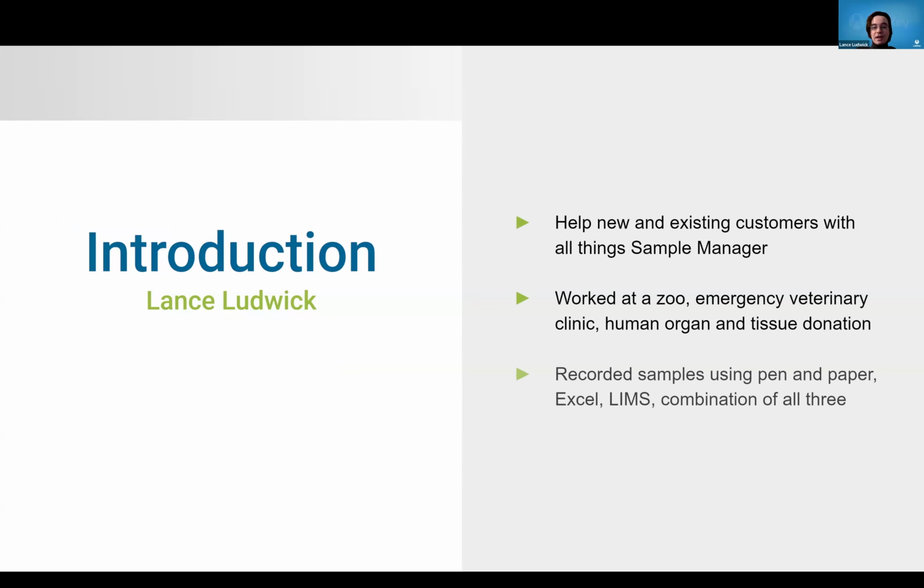At these places, I was recording my samples using a variety of different methods, from pen and paper to Excel, LIMS, or a combination of all three of those systems. So I'm very familiar with a lot of the challenges that these systems bring. That's why I'm so excited to see how Sample Manager has been able to take a lot of those challenges and further improve on them. It's an amazing software that I wish I had when I was at a lot of these other places.